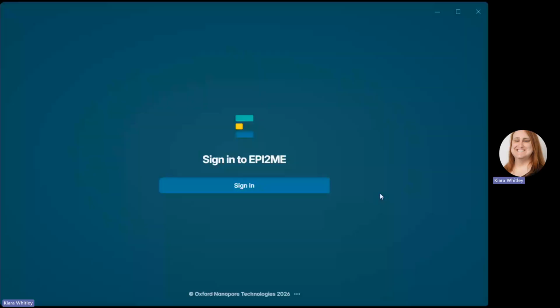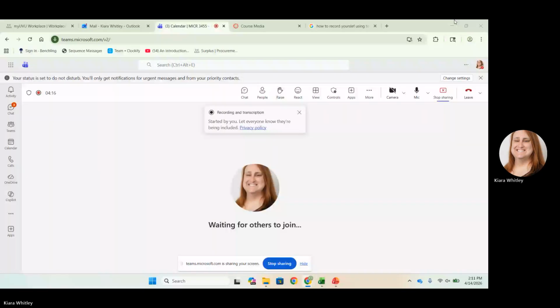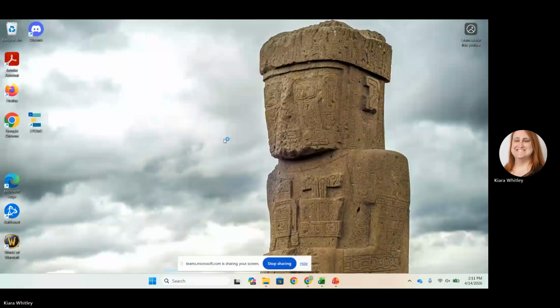Okay, so here we're going to sign in. Okay, let's try this. All right.